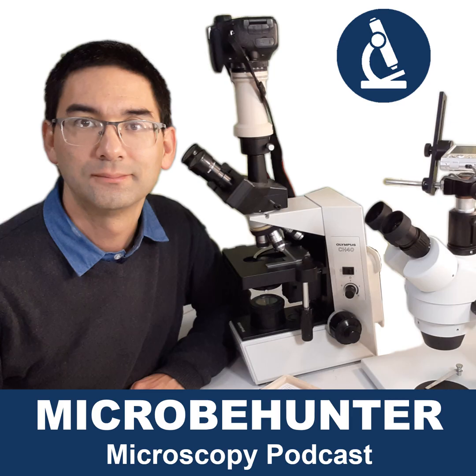If you do not have the money at all, if you really are low on money, which I think you might not be because your requirements are quite high, but if you have a very thin wallet, you can buy microscopes already for less than €100, less than $100. With these you can also see quite a lot, and you can have a lot of fun with them as well.